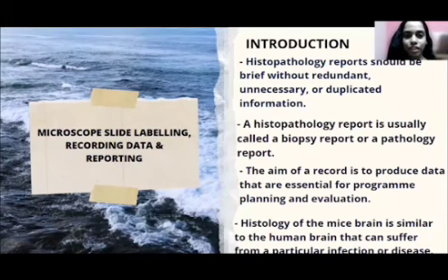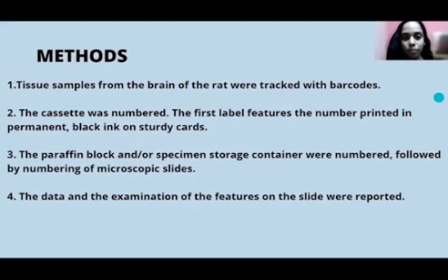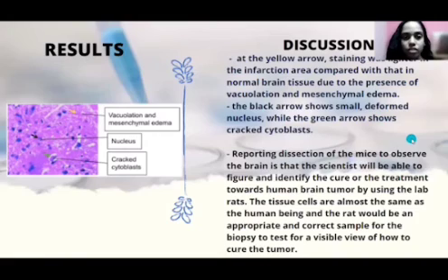Good day, Doctor. I'm Sivarani and I'll be presenting about microscope slide labeling, recording data, and also the reporting. For an introduction, the histopathology report should be brief without redundant, unnecessary, or duplicated information. Next, we'll go to the methods. There are 4 methods for this process. Next, we'll go to the results and also the discussion.